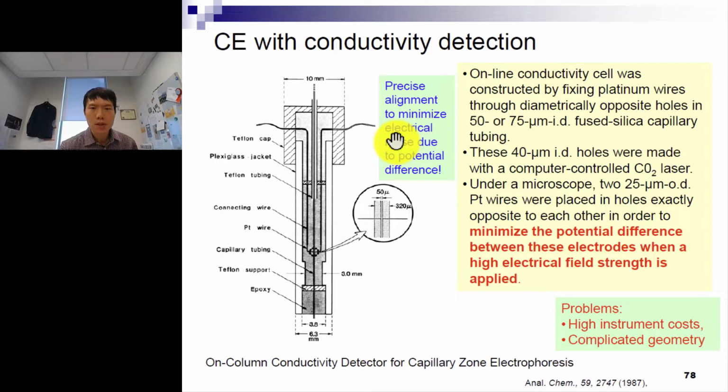Another diagram here. I think the key thing to note is how precise this microengineering is in controlling the microfluidic movement of liquid. The small 50 micrometer internal diameter is extremely hard to achieve. A lot of precision engineering is involved here.